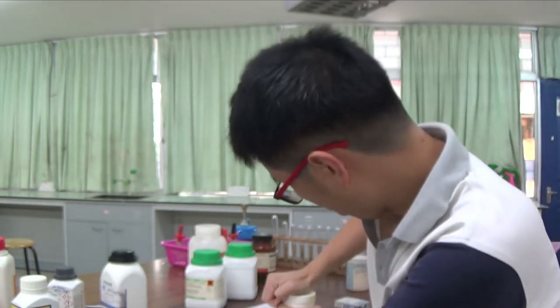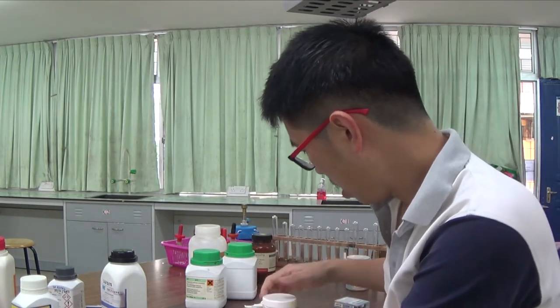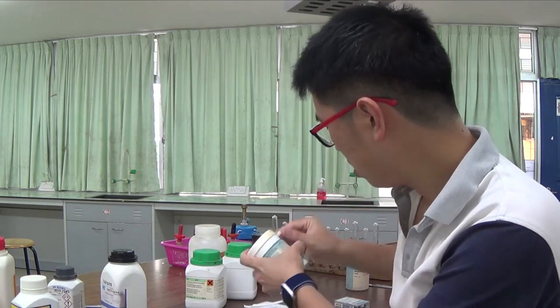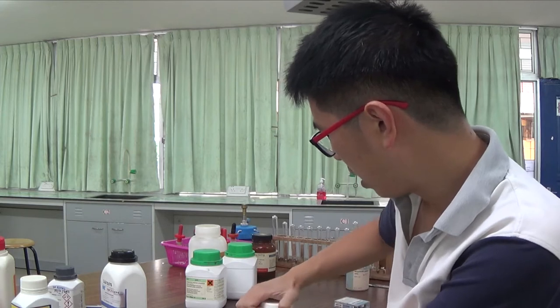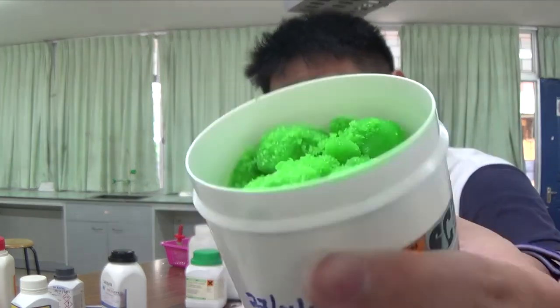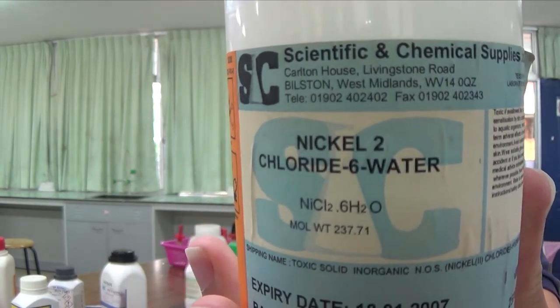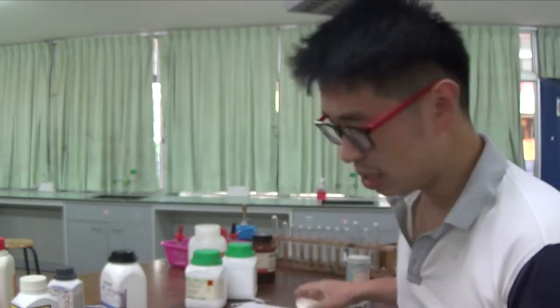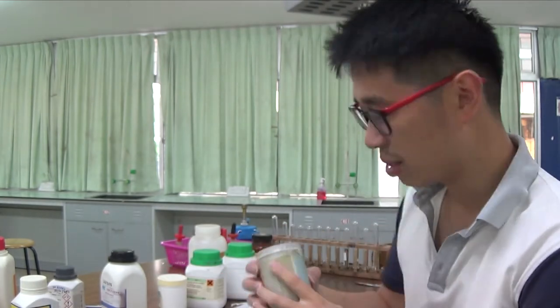Let me open this up and show you if I can open it. And yes, I can open it. So very old, obviously. A lot of the times, these kind of chemicals are not really tested in O-level. Beautiful green color. This was nickel(II) chloride with 6 water of crystallization. You can work out the molecular weight. Transition metals form very beautiful colored compounds. Okay? These are all hydrated compounds.